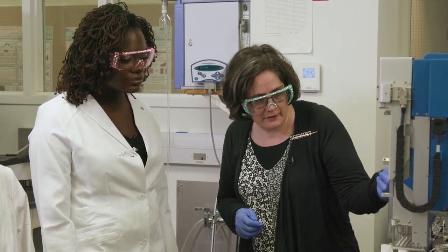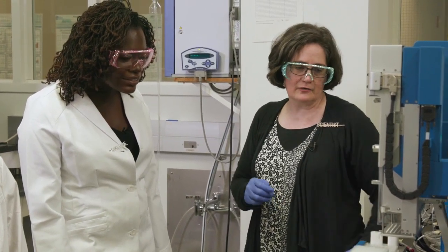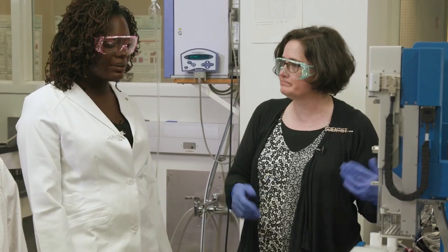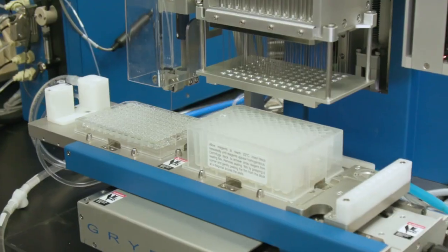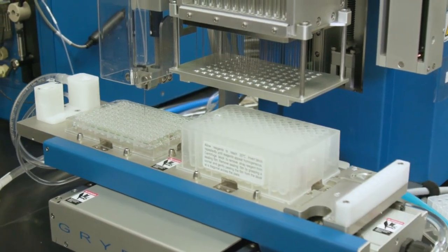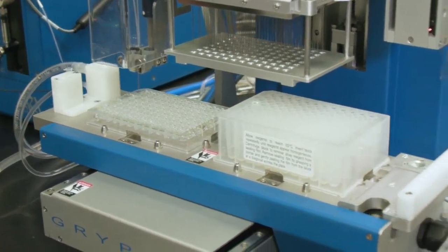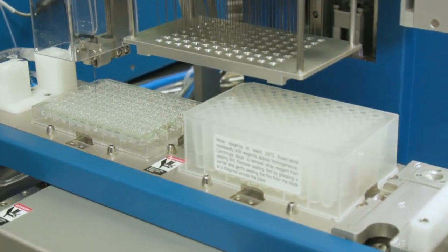And what this is doing is pulling water up and pushing it back down just to make sure that it's nice and clean for getting the protein in there. Okay. So this is where the protein's being dispensed, okay, into each of those little drops. So fast. That is crazy. The drop is tiny. Yeah. My eyes can't see that.